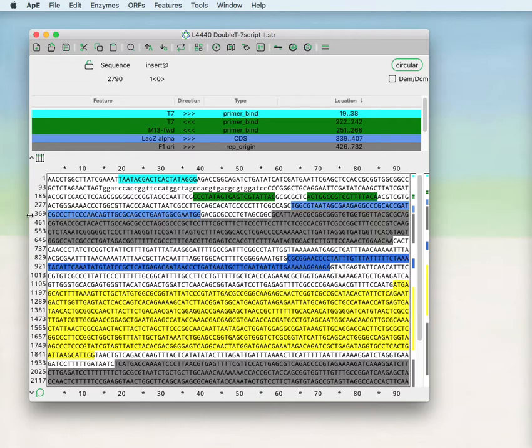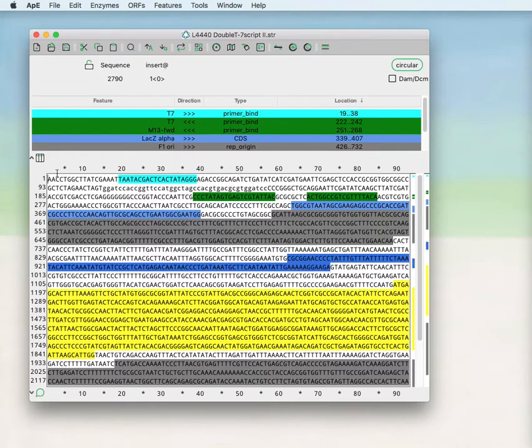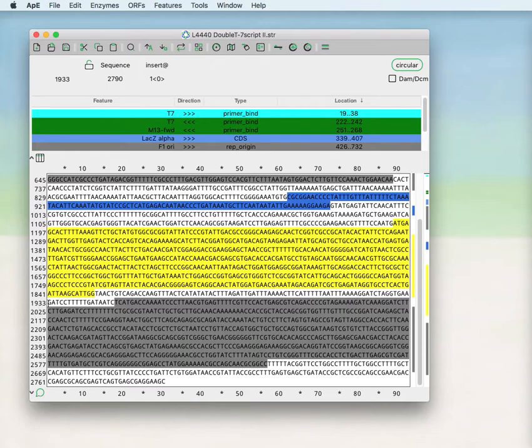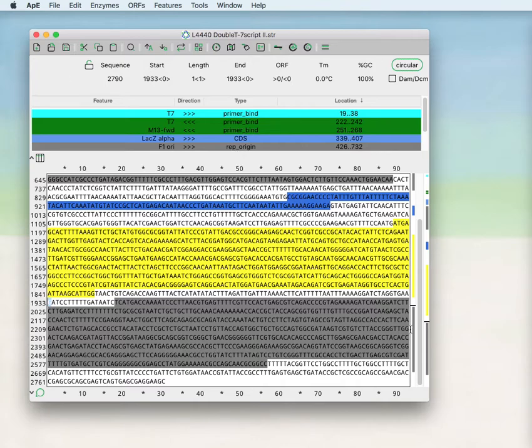Then there is a sequence window with numbers across the top indicating the base position horizontally and then vertically as you scroll. These numbers indicate the index of this position. There is a map of currently highlighted features here that we'll talk about in a later time.